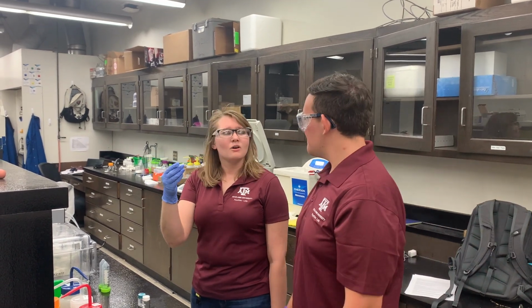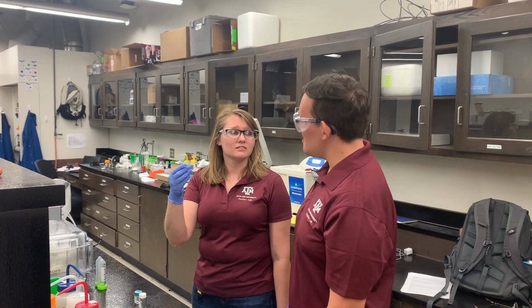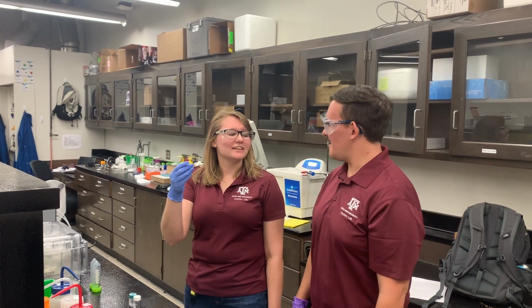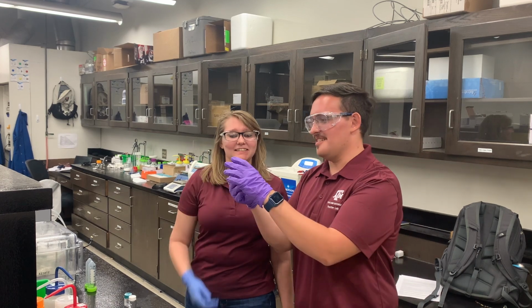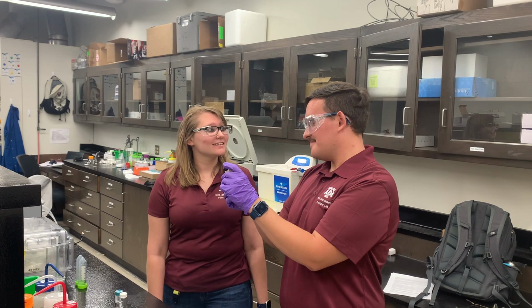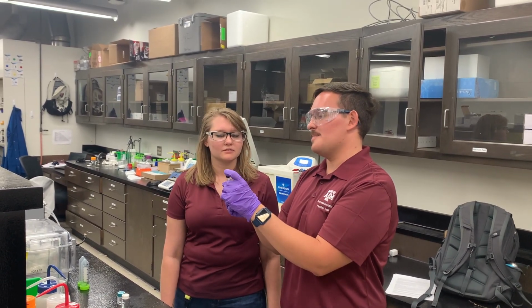Kristin, what's up? Well, Karen gave me the sample and told me to characterize it. Okay, do you know what it is? Yeah, it's powder. Oh, but what kind of chemical? That's a really good question. Let's take a look. Does it happen to be calcium oxalate? Maybe it is. Okay, well we can still characterize it using thermogravimetric analysis with mass spectrometry.